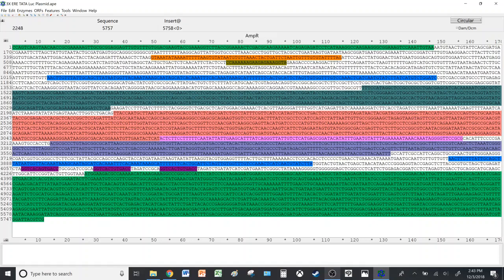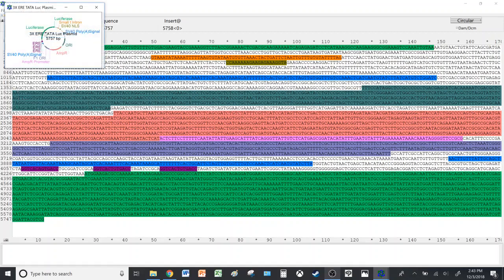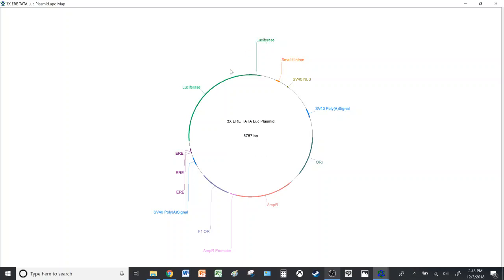So let's get started. Firstly, if you wish to create a plasmid map with just the plasmid sequences and the highlighted features, you'll go to Enzymes, Graphic Map, enlarge it, and that will be your plasmid map. As you can see, it highlights the features that we labeled in the previous video.